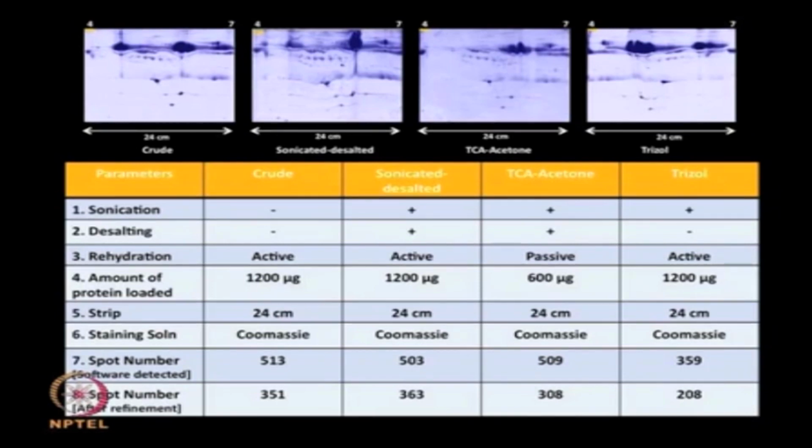And this lecture is actually trying to cover various concepts which we have talked about in the sample processing and in different lectures of two-dimensional electrophoresis.